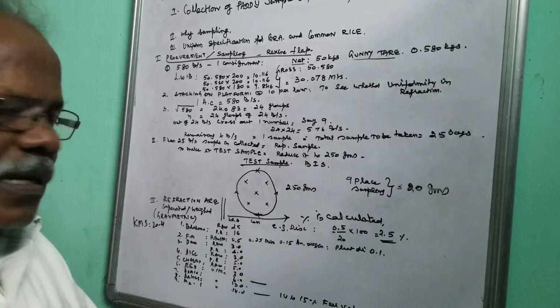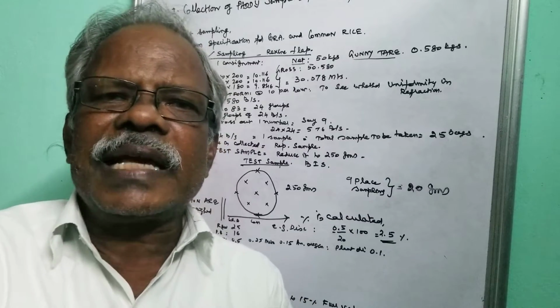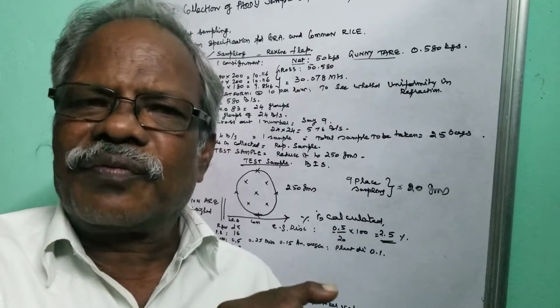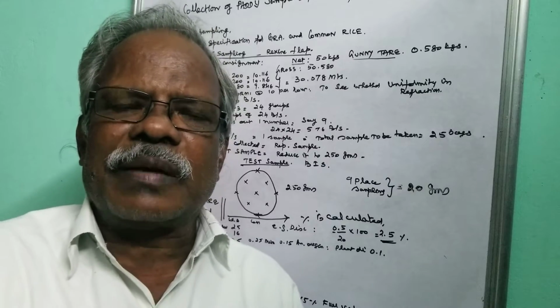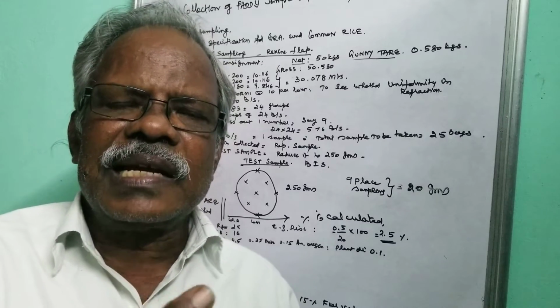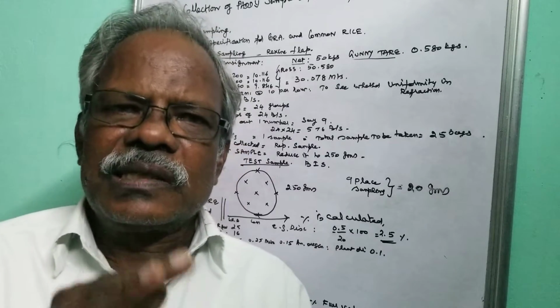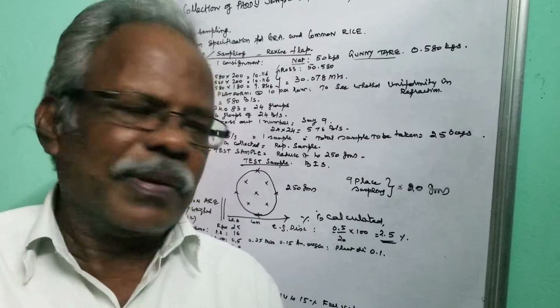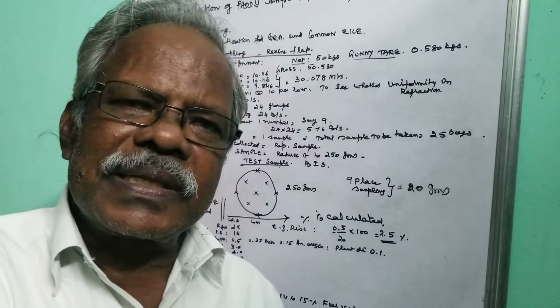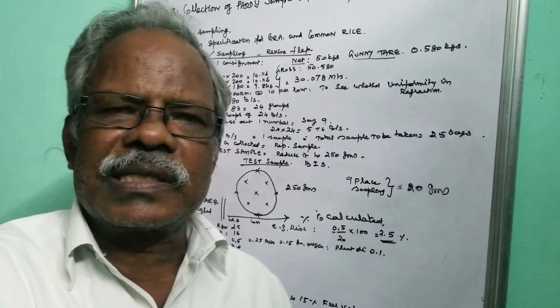Then damage means it will not fetch any food value. In case of boiled rice, even a dot is considered as damage. Not only full damage, even some dot is taken as damage. Mainly if it changes color and becomes black, then it is taken as damage. It is not having any food value. In case of raw the damage percentage is 3, and in case of boiled it is 4% for both grade A and common.